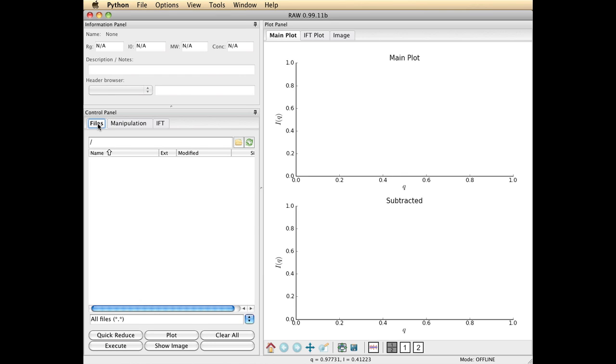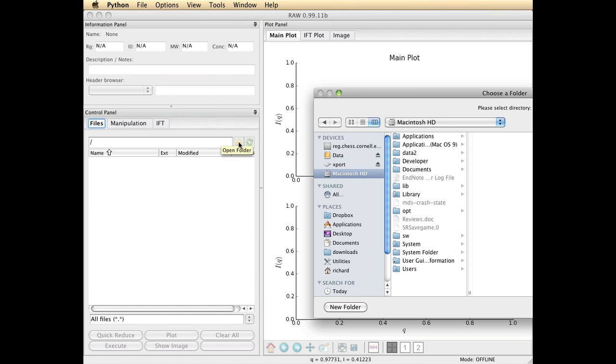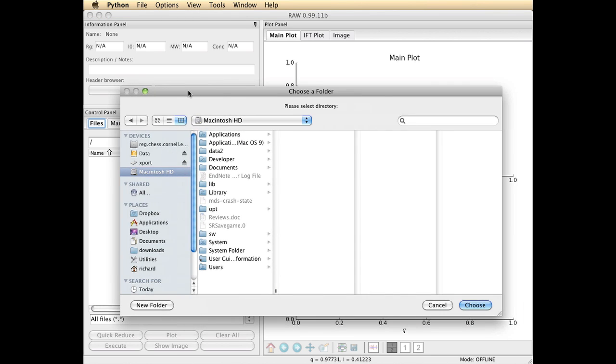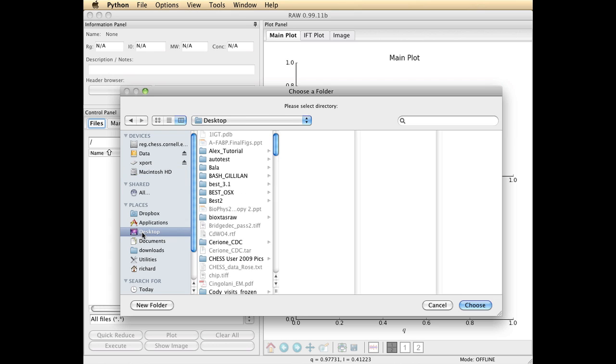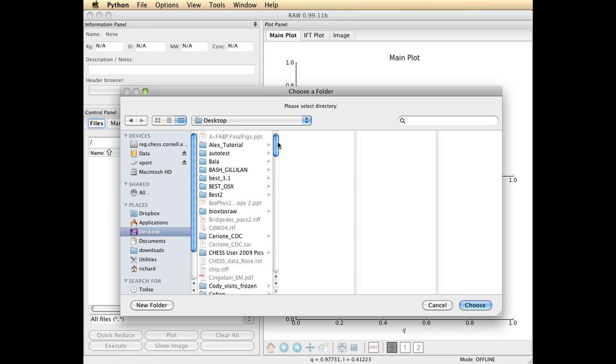I'm going to use the file tab to navigate in my file system and locate a standards folder which contains some scattering profiles I collected on MacChess's F2 station. You click on this open folder icon and it launches a window that allows you to navigate to the source of your data.